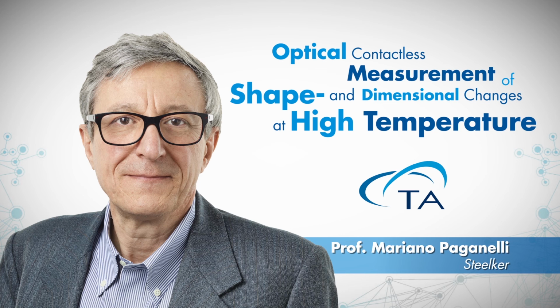Okay, thank you. So basically it's up to the sample and the temperature, if I correctly understand that. The closer to the softening point, the more you suggest to switch to optical versus push rod. Exactly.